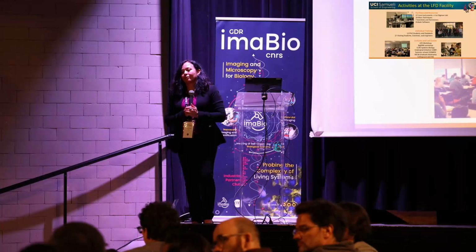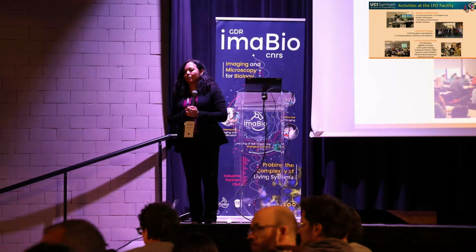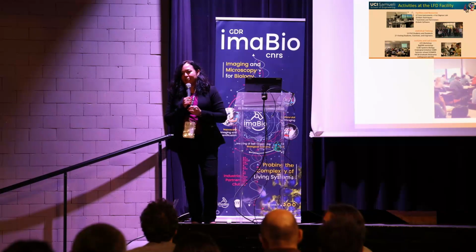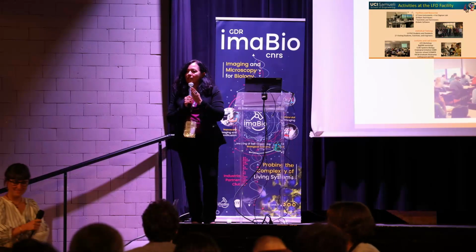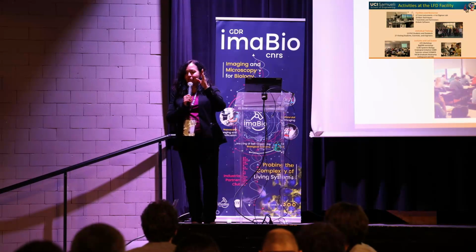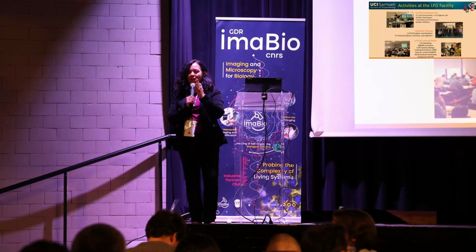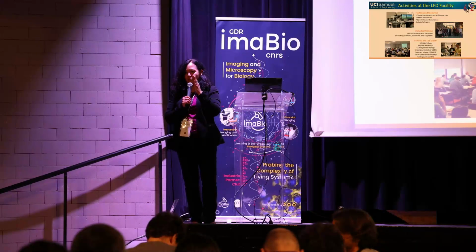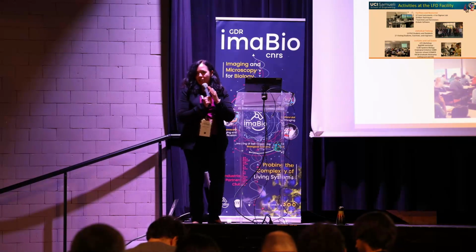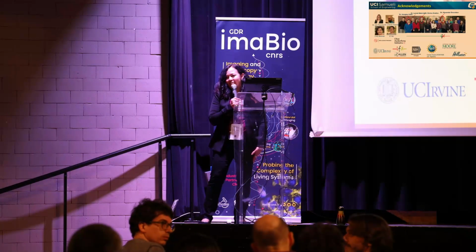I'm sorry for the extremely naive question, but I don't know what is a sine or a cosine filter. Yes, so these are special filters that transmit light of a certain range of wavelengths. So from 400 nanometers up to about 550 for one of the filters, and then the cosine filter from 500 to about 800 nanometers, so 750 nanometers.